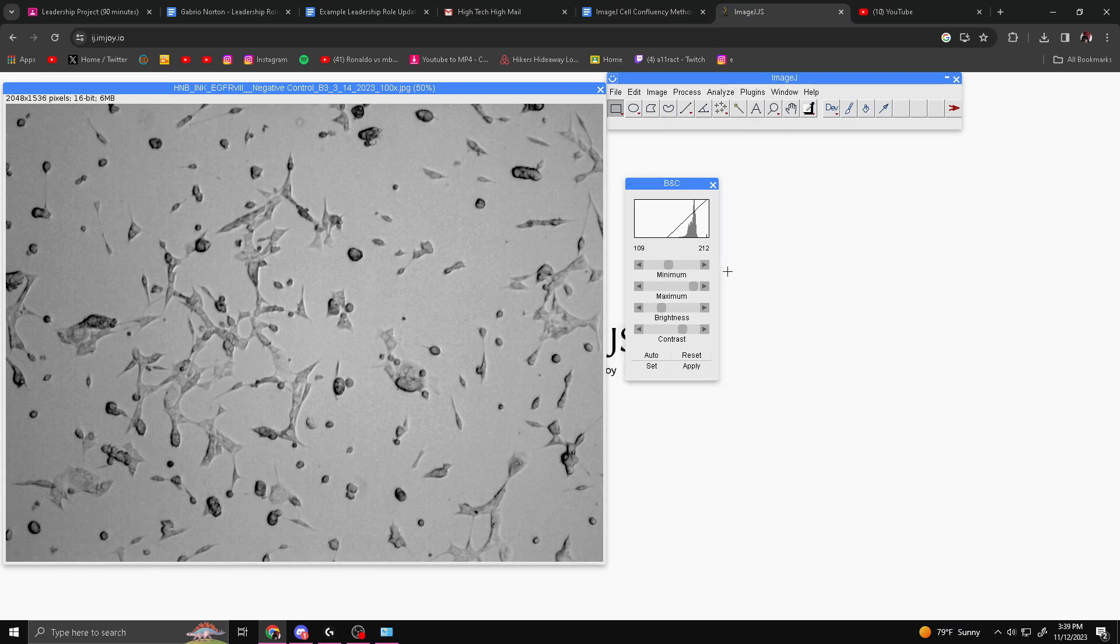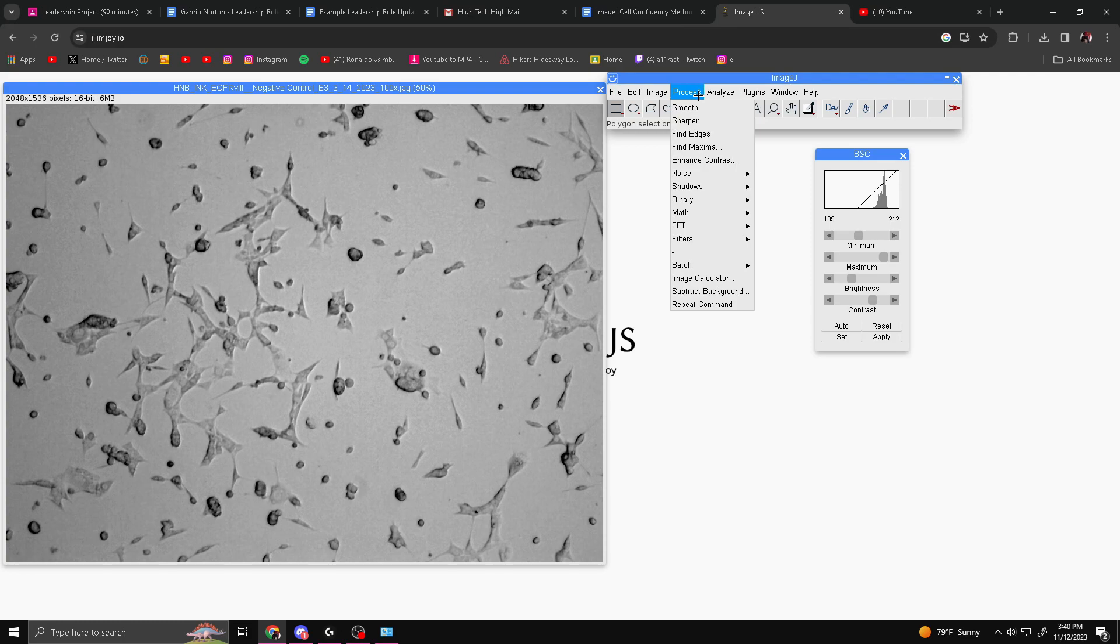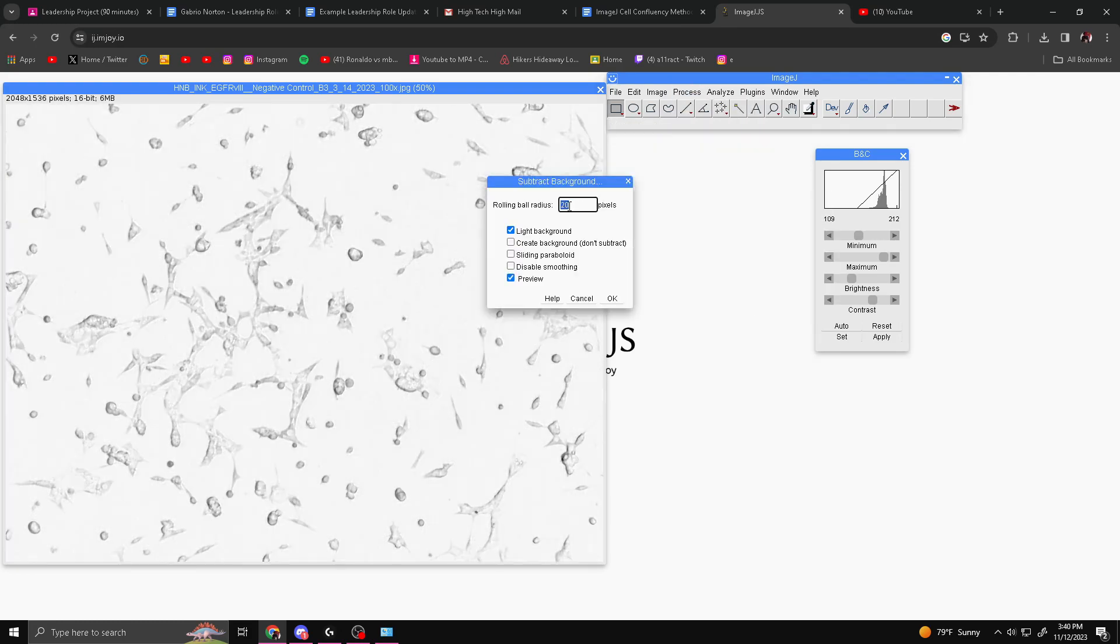When we're done messing around with it, I found something about this works out. Then we're going to subtract the image background. You can do this by going to Process, clicking Subtract Background. You want to change the Rolling Ball Radius to 20 pixels, and you want to select Preview as well.